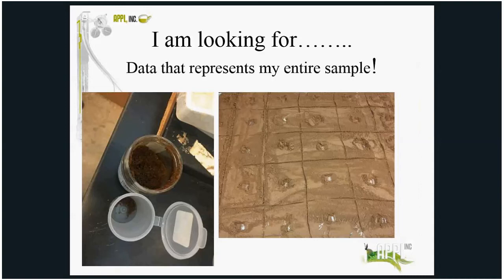The entire field MI sample that is collected and submitted is processed during the MIS sample preparation, but only a small portion of a discrete sample is processed. On the left-hand side in the plastic container is 1 gram to be run for metals.